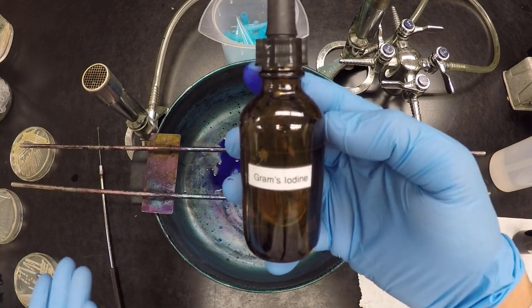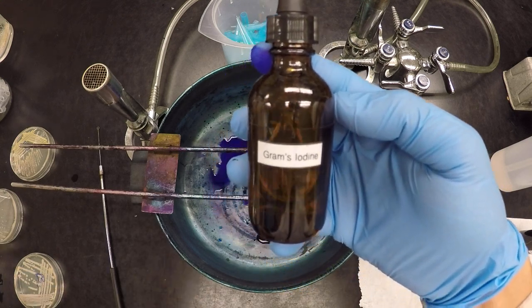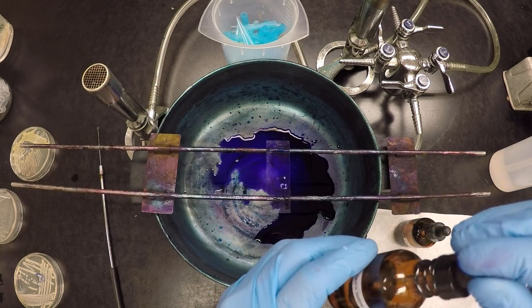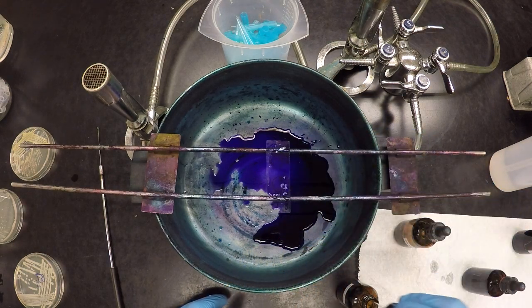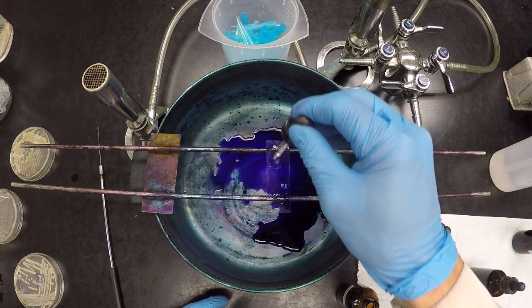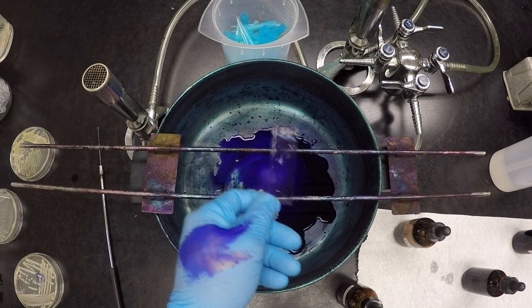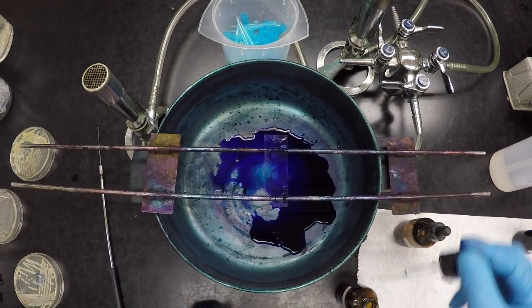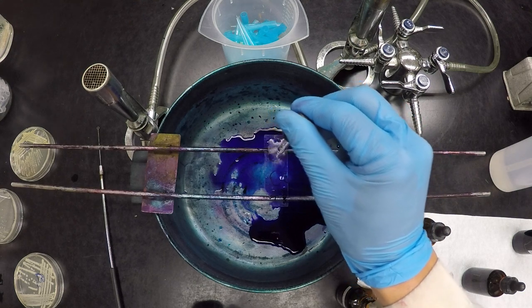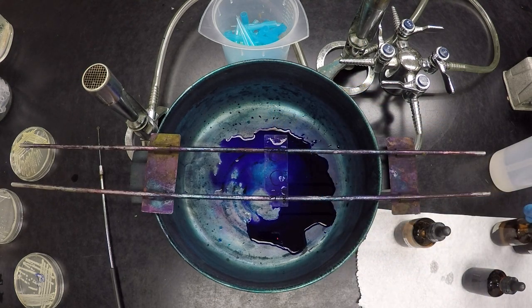Whereas the gram-negative cells don't have those teichoic acids, right? So the Gram's iodine is not going to react with them. Now, some say that the water inhibits the reaction, so what is commonly done is you flood your slide, give it a little bit of a shake like that, tap it off, and then flood again. All right, and you just let that sit again, just like before.